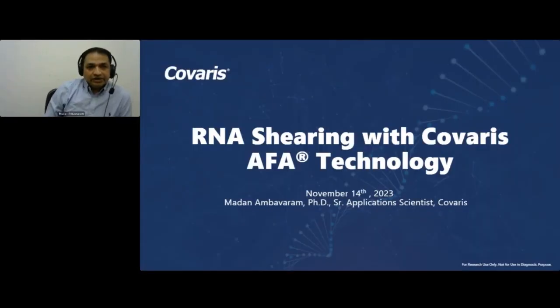Hello, everyone. Thank you, Kelly, for the kind introduction. Also, thank you, Stuart, for the wonderful and enlightened presentation. My name is Madan Ambavaram, and I am the Senior Application Scientist at Covaris. It gives me immense pleasure to present today alongside Dr. Stuart Levine. I would like to take this opportunity to discuss RNA shearing solutions using Covaris proprietary technology, Adaptive Focused Acoustics, AFA in short.